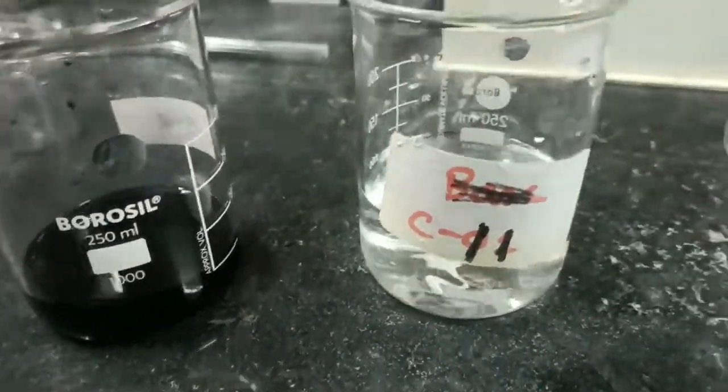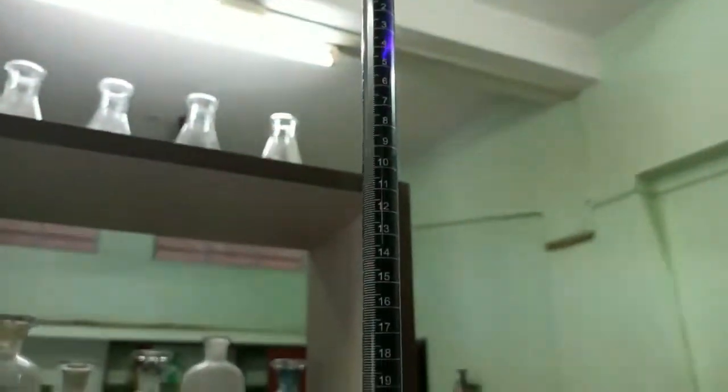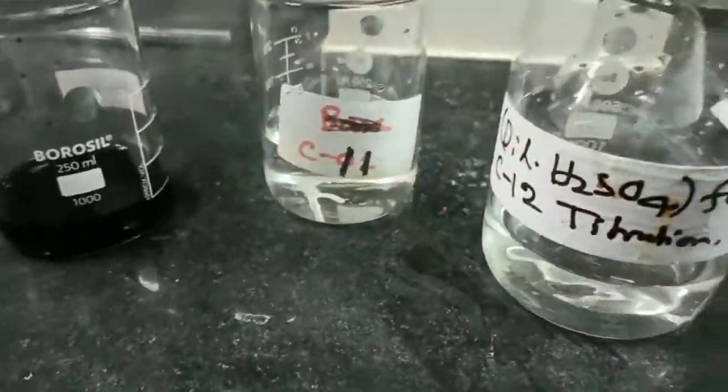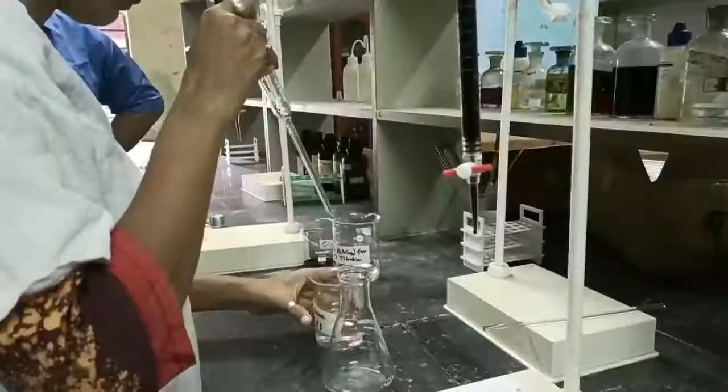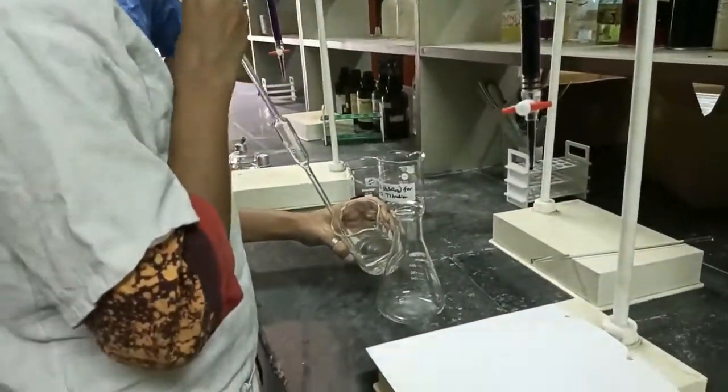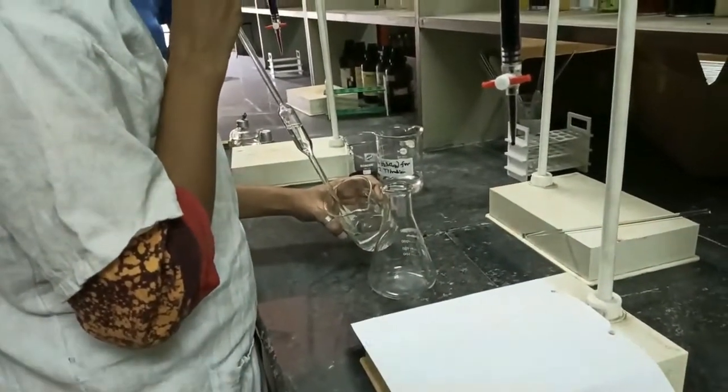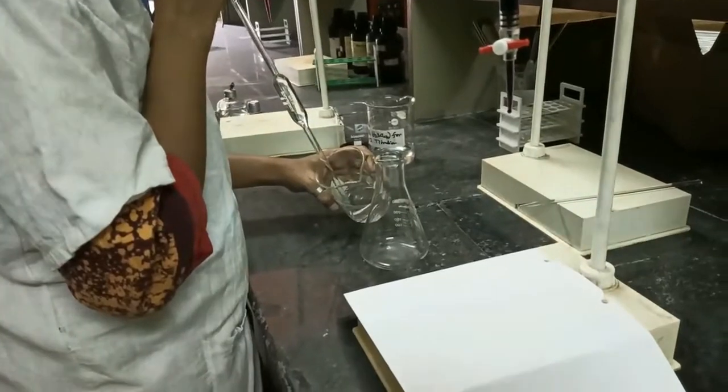We have dilute sulfuric acid. Already the burette is filled up with C10 solution. This titration is based on permanganate and oxalic acid redox reaction, acid catalyzed. So today our titration is based on the redox reaction among potassium permanganate and oxalic acid. It's also permanganometry and here potassium permanganate is a self indicator. So we are not taking any indicator from outside.